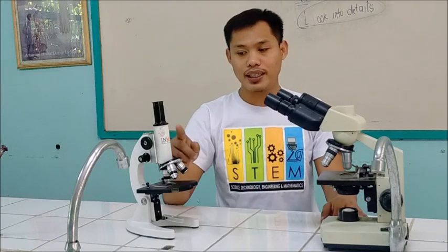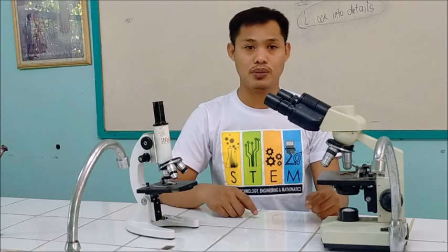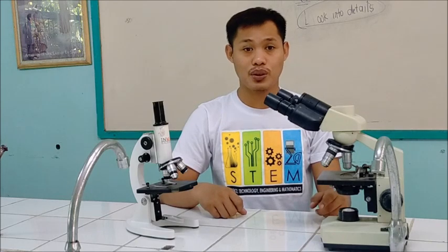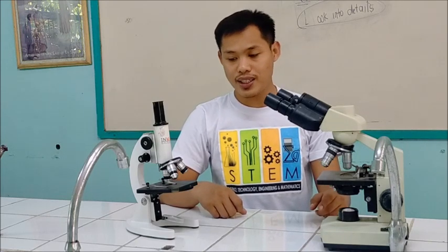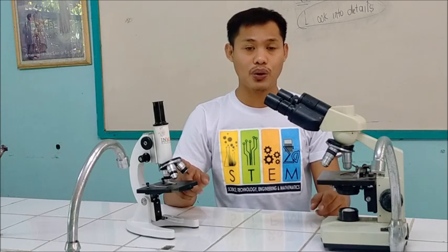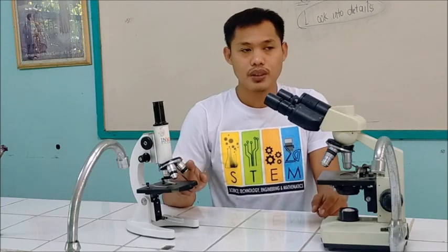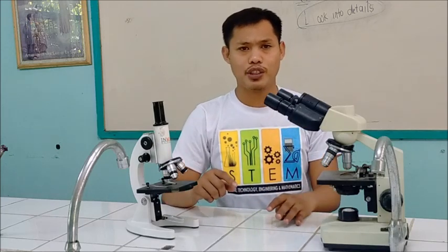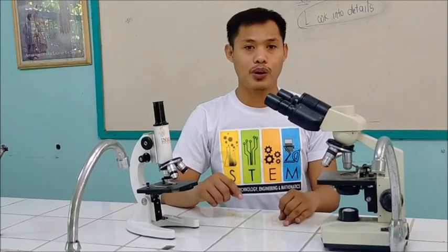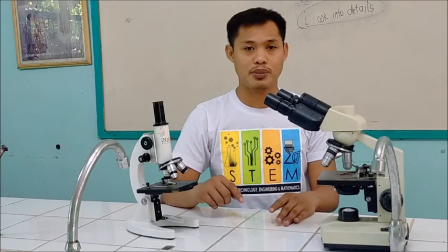The next part is the draw tube, sometimes known as the body tube. The draw tube or body tube holds the eyepiece in its position. The next part is the revolving or rotating nosepiece, which holds the different objectives. We have four types of objectives: the scanner, low power objective, high power objective, and the oil immersion objective.